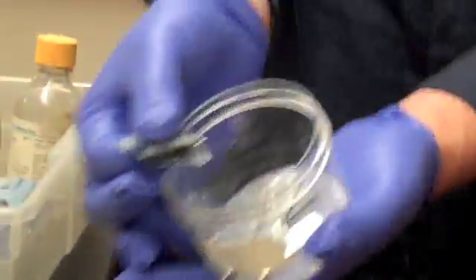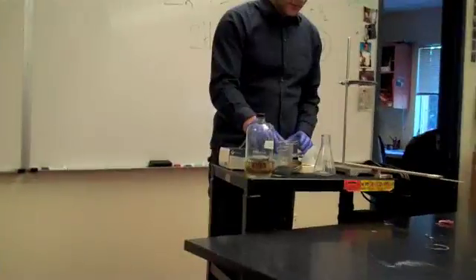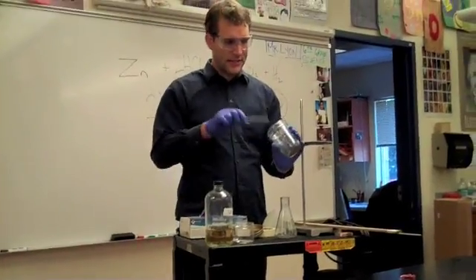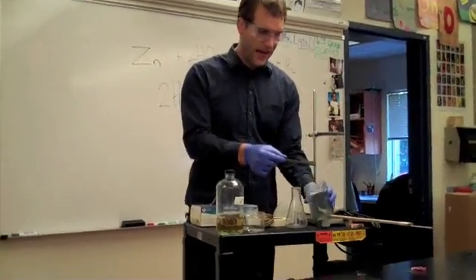Here are some pieces of zinc metal so you can see it's a nice shiny metal, but I also have some powdered zinc that I put in this jar here. It's a duller color. I'm going to go mostly with the powdered zinc because it gets the reaction going nice and fast.